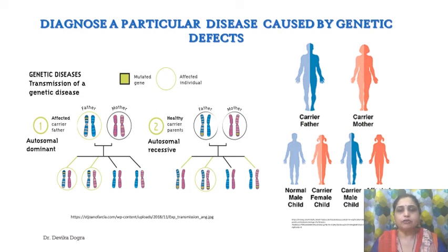If the oligonucleotides are kept short, that is about the range of 20 nucleotides, they can be hybridized with DNA at a temperature selected so that only the perfectly matched helix will be stable. Such oligonucleotides can thus be used as label probes to distinguish between the two forms of the gene by southern blotting on DNA isolated from the fetal cells collected by amniocentesis.